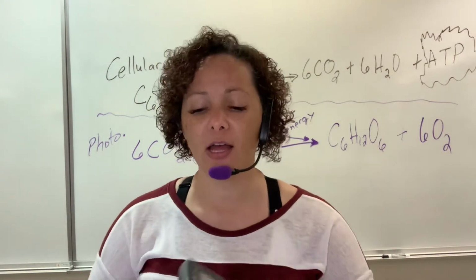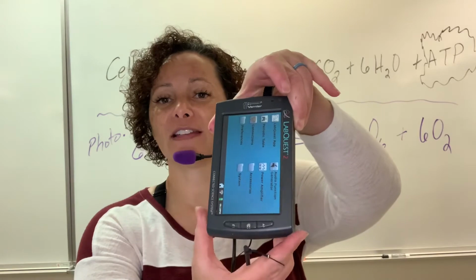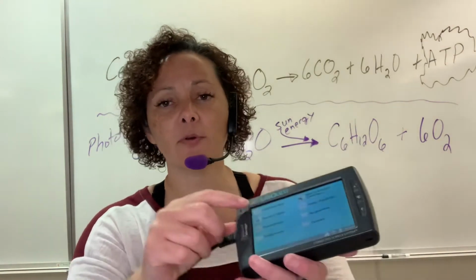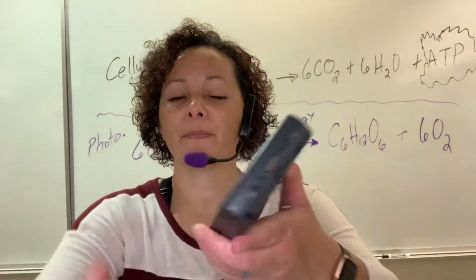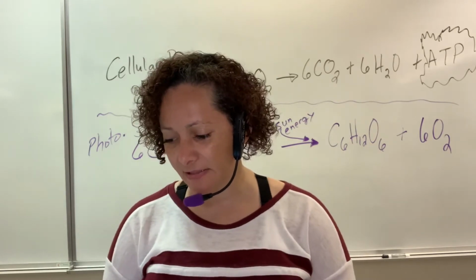If you ever get lost, hit the house button. House button. If you ever get lost, okay? Now when you hit that house button in the middle and you got lost, whoops, let me do it again. Now you always choose LabQuest app. LabQuest app, right there. Boom, you're ready to roll. So from there, you're going to go ahead and set this.